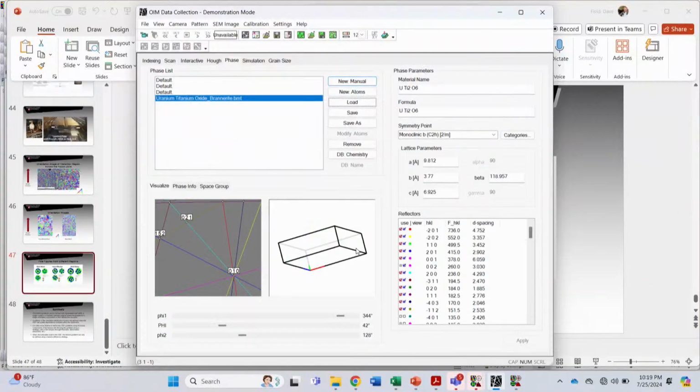Yeah, so he said, oh, okay, so now we can index them. So you're convinced that we can index them now with EBSD, but now texture analysis is a problem, right? So, you know, we know what FCC rolling should be in HCP and BCC, but what do we know about rocks? So if you go to the geology department, they know a lot about rocks.